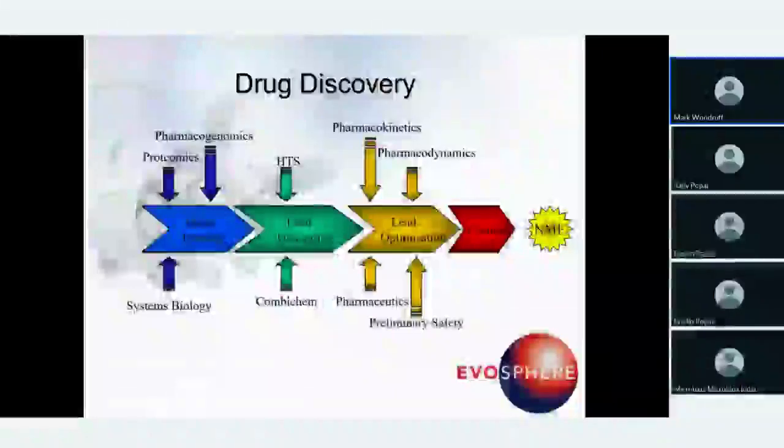So in terms of general pharmaceutical analysis, whether you're at the beginning of the drug discovery process, or further along the line, lead generation, lead optimization, heading into clinical trials, HPLC and HPLC columns are used throughout that whole process, from initial discovery and looking for targets, all the way through to the launch of a new molecular entity onto the marketplace. So, HPLC is pervasive throughout that whole process.